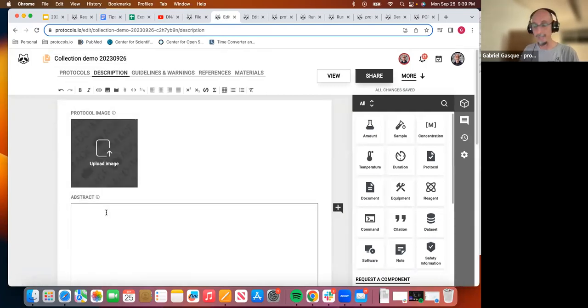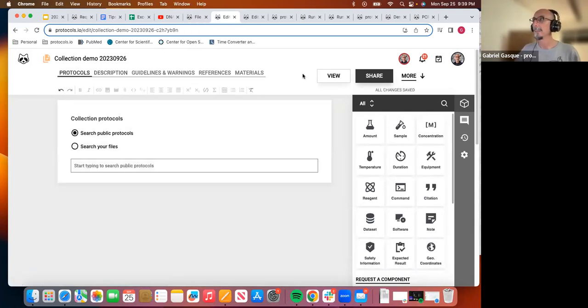I can add an abstract. And now I can start adding protocols to this collection. I'm going to search in my files.